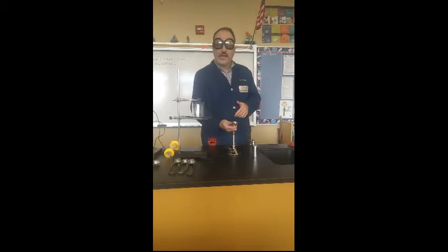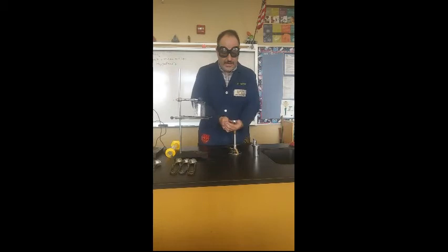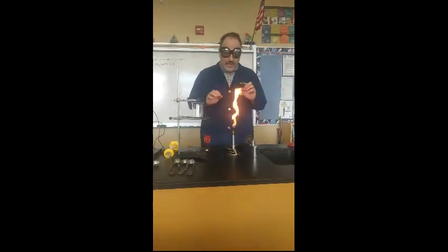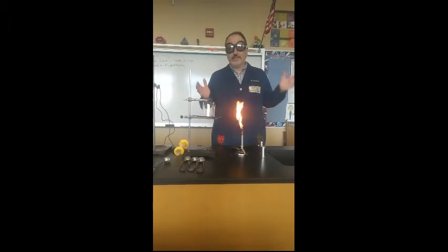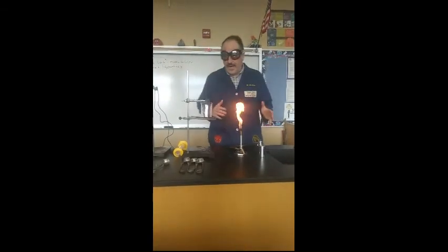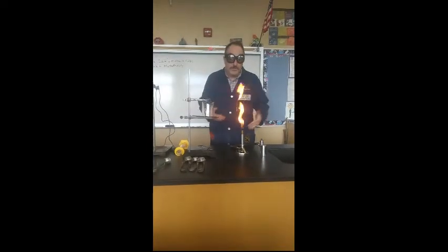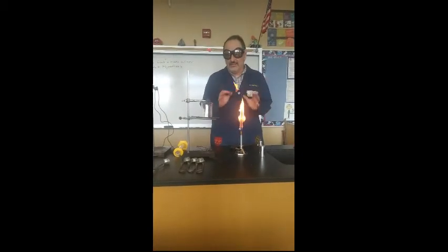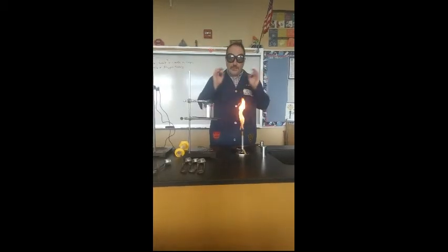Now, if the first time it doesn't light, try readjusting your hand. You can use two hands or whatever, and then go ahead and light it. All right? Now, notice I didn't freak out when I lit it, because that's the only time I ever got anybody injured: when they light it and they freak out and they knock stuff over, they bump into the person behind them, knocking them into the fire and so forth. So just treat these like a wild animal. Burners can smell fear. So you always want to approach it with confidence and you should be okay.